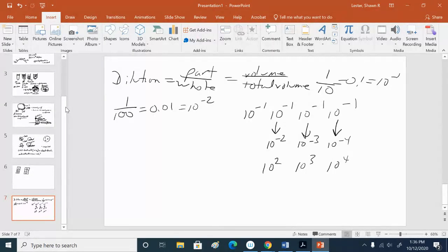Now, this only works exactly like this if you transfer 1 milliliter of sample onto the agar plate, right? Because you always have to multiply the volume added to the plate times the dilution in the tube. So if it's 1, then nothing changes, right? Because you're multiplying by 1. But what if you were adding 0.1 milliliters? So you have to factor this into your calculation, right?